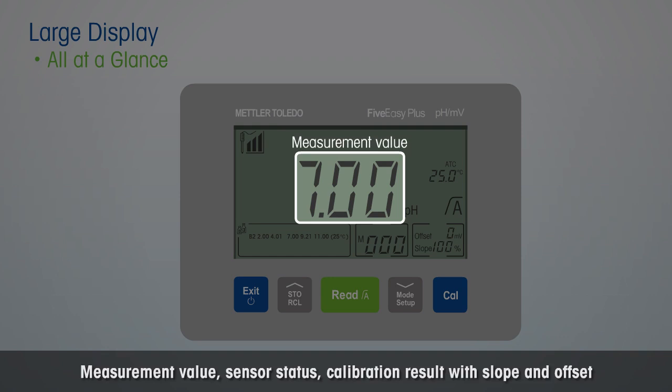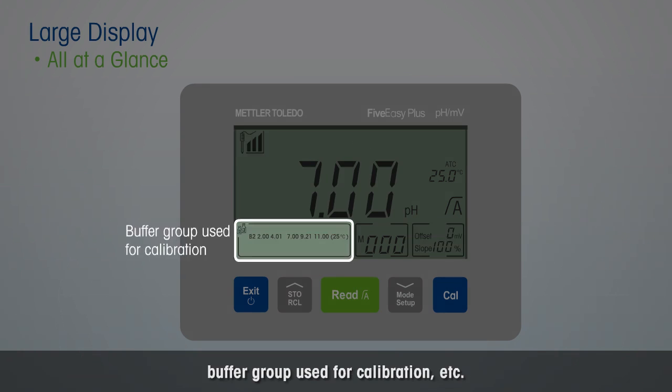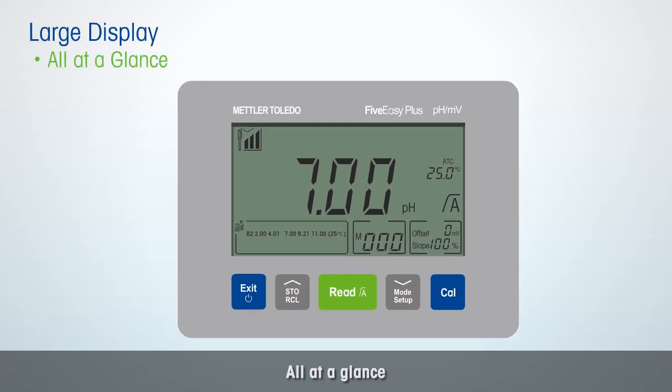Measurement value, sensor status, calibration result with slope and offset, buffer group used for calibration, etc. Pre-defined buffer groups are available to choose from. All at a glance.